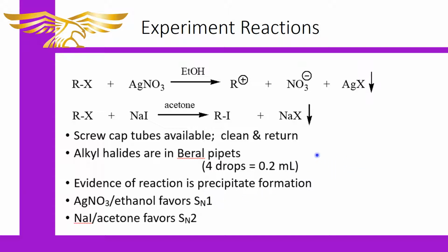Is that really accurate? No, it's not super accurate, but we don't have to be spot on the nose for this. We just have to have a good rough estimate of about how much volume you're putting, because we just want you to kind of get rough numbers for this and see the difference. We're not looking for a full-on quantitative kinetic kind of output from this particular set of experiments that we're doing.